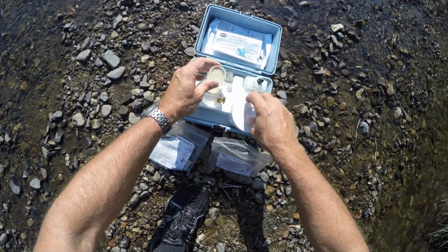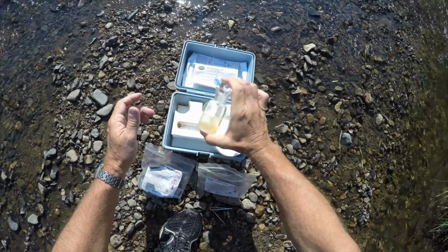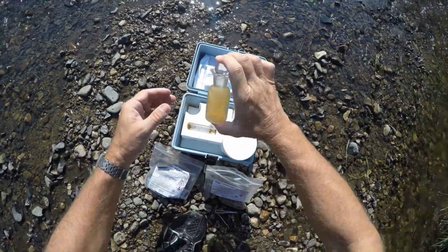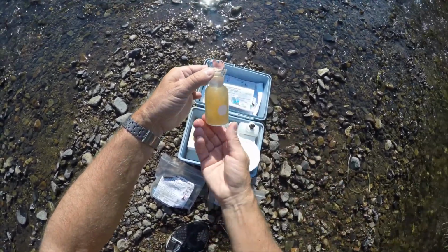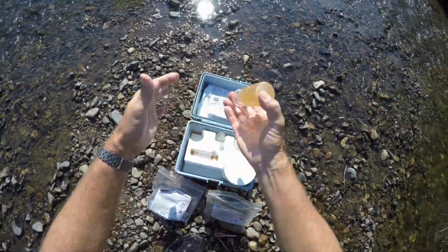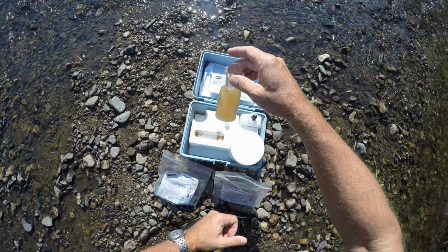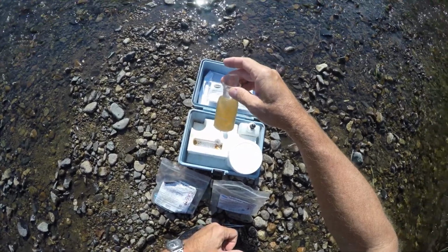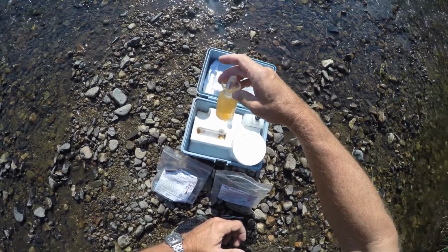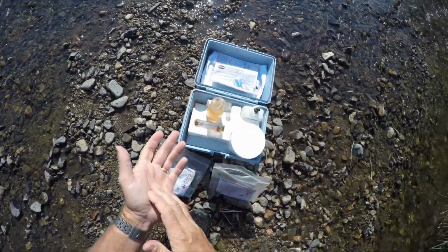Now what you're seeing here is a chemical reaction from the chemicals that I added. We'll shake it up. And it gets all cloudy and yellow with some floaties in it. That's called floc. That is supposed to happen. That's a chemical reaction that takes place when we add our chemicals to do our dissolved oxygen test. So we'll let that sit for a minute. Now remember, we need to get above 6 parts per million. Today with our temperature, the limit is right about 10. Hopefully we fall closer to that than we do closer to 6.